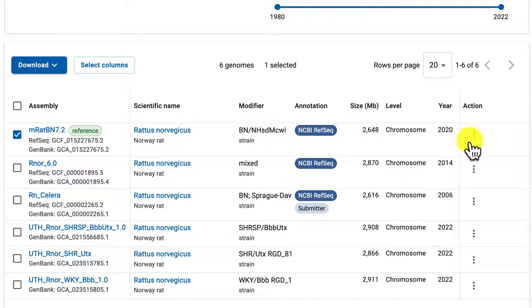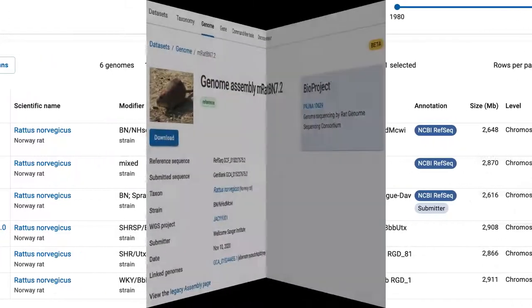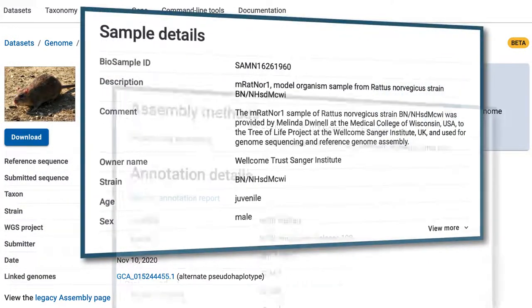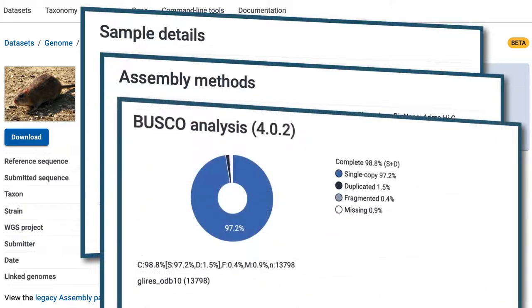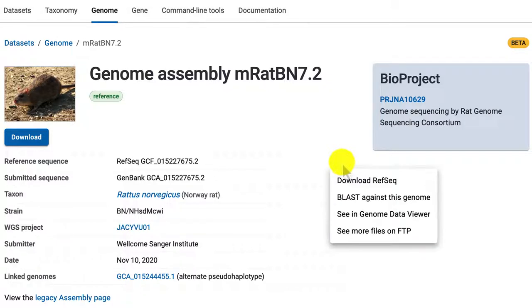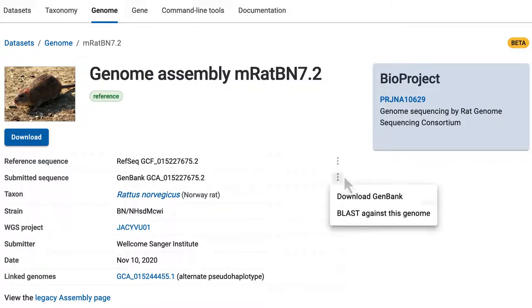The action menus provide more options for each assembly, including the same download function that we just saw. Let's follow the link to view assembly details. Here you see significant metadata. Similar to the action button on the previous page, these two menus offer options for the RefSeq and GenBank assemblies.